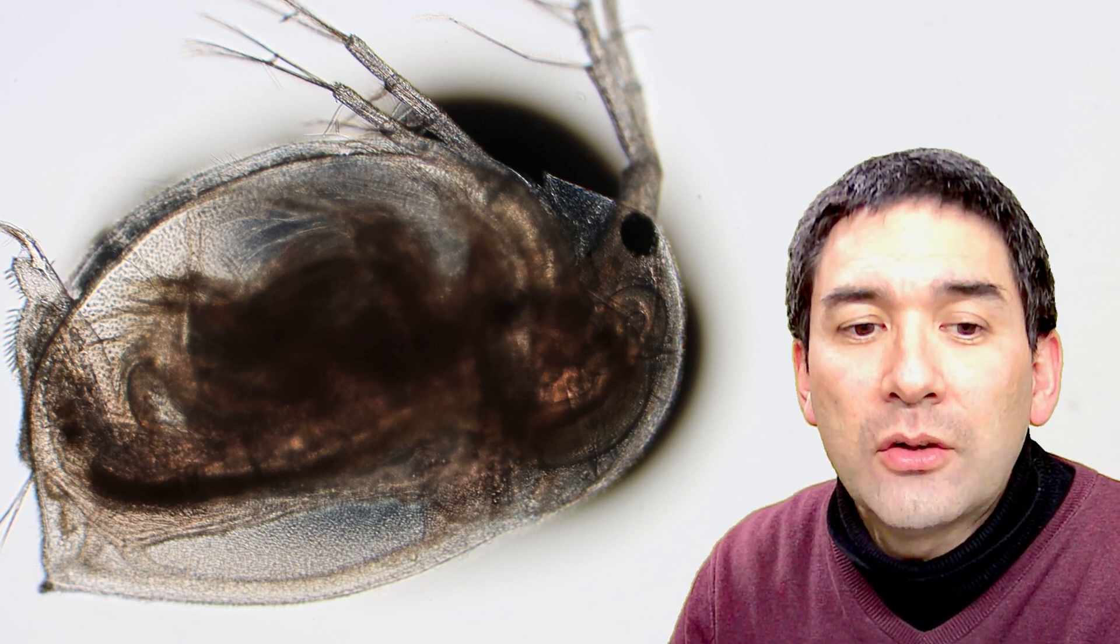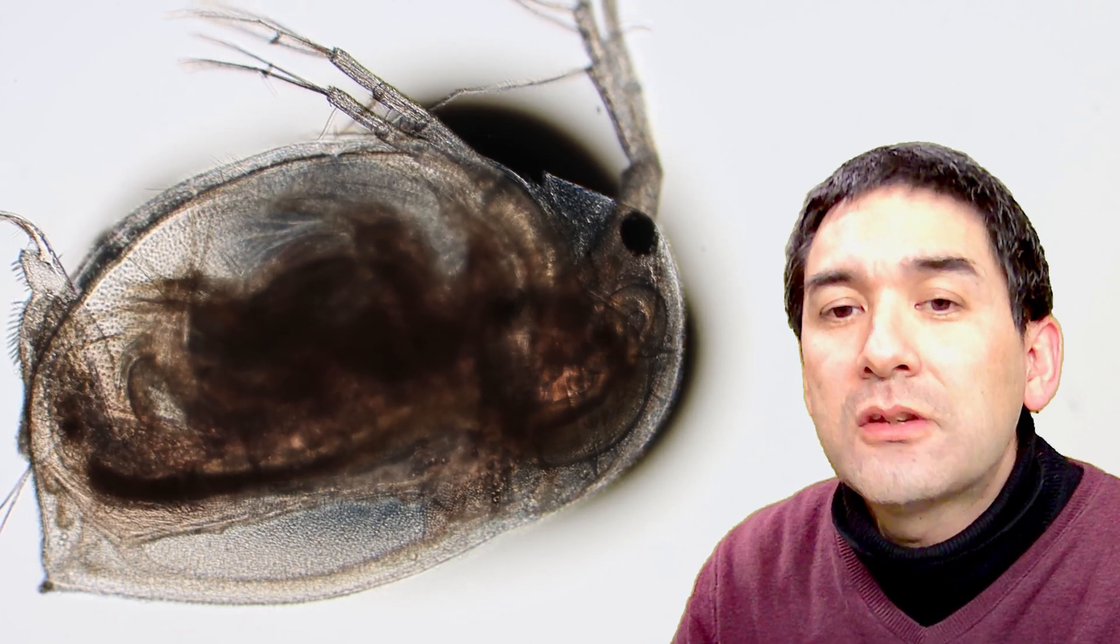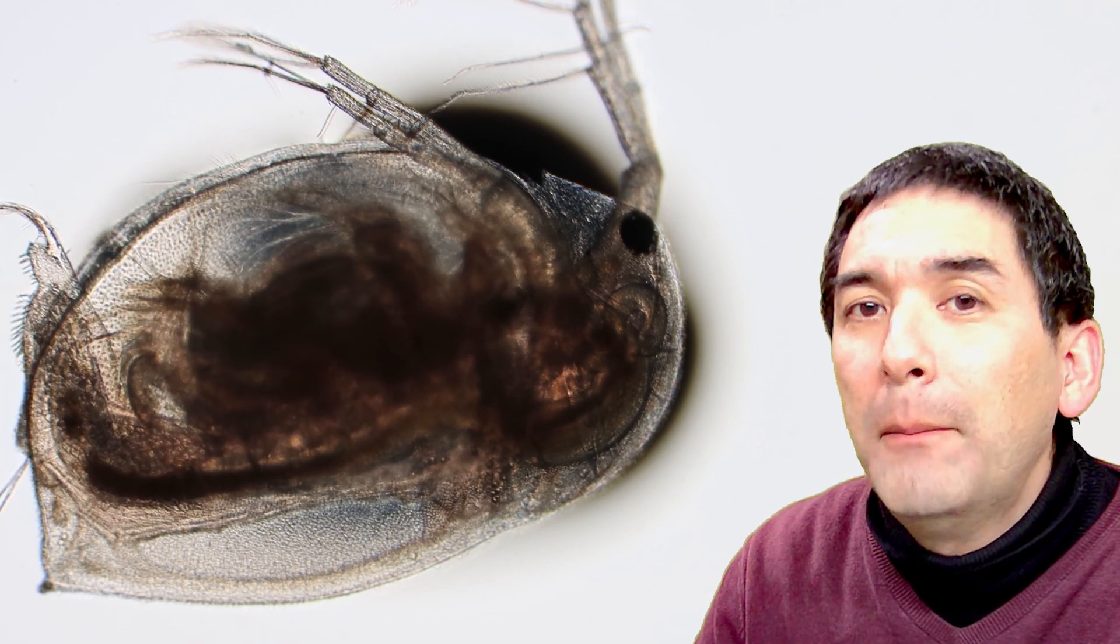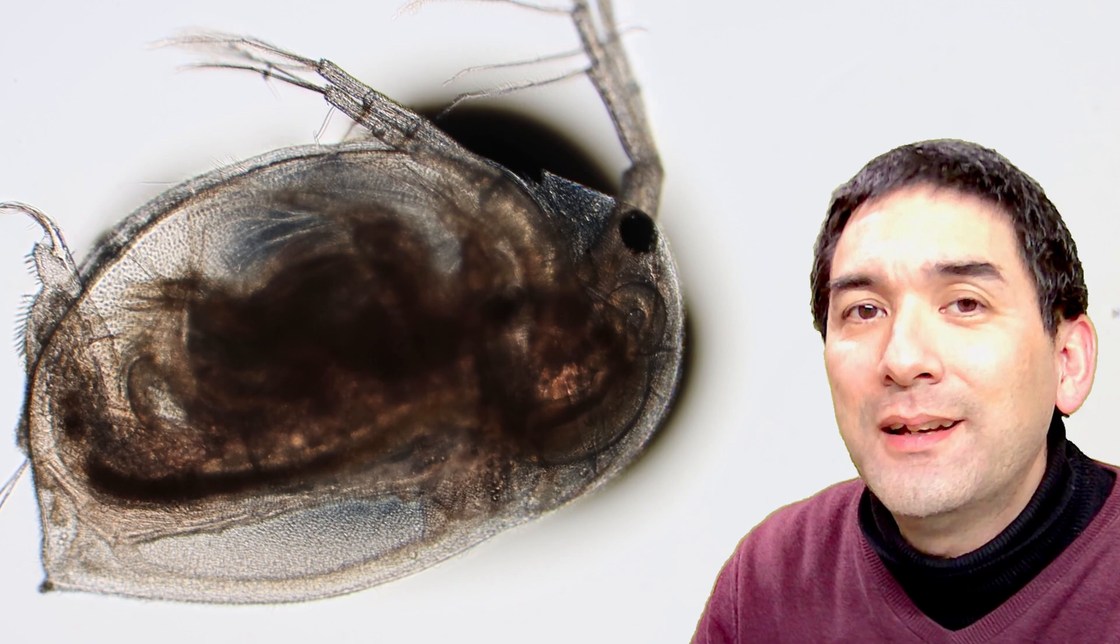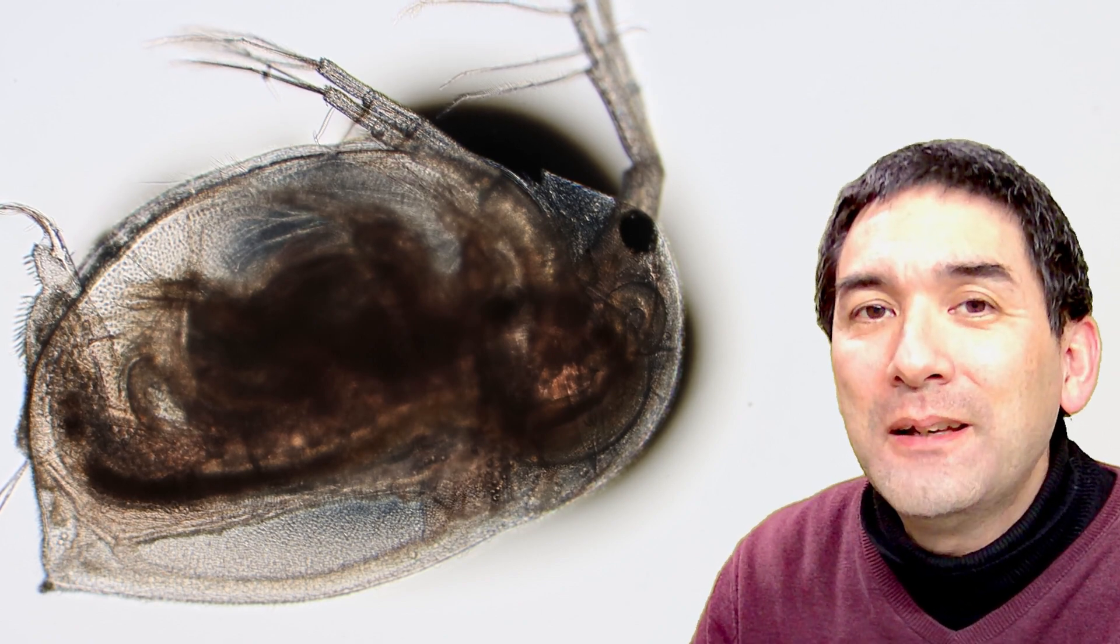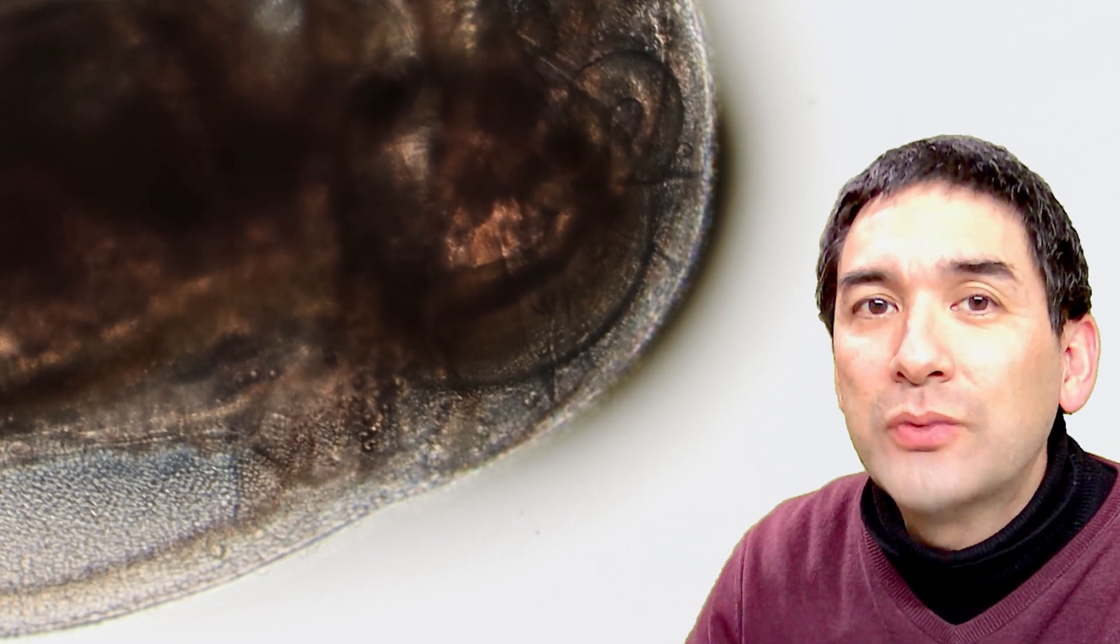Okay, so let's move the arrow again out of the way and let's continue, and look, it starts to slow down quite a bit and it also starts to pump a little bit irregularly. Now it's very slow, and now it's faster again, and it slows down again, and then it speeds up again, but then later on it actually stays relatively slow.